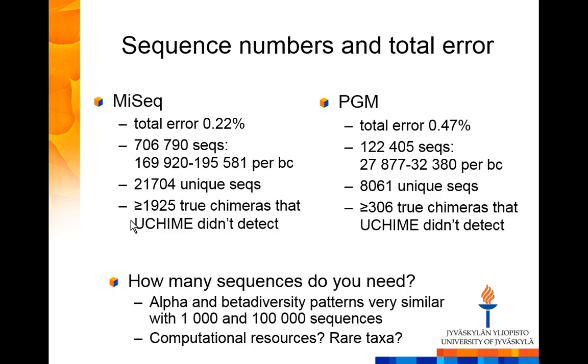Singletons should be justified as well. For example, in Vierer Lab, they do it on sequences. But we just got reviewer comments saying that you should never leave out singletons, which I don't agree with. At least for OTUs, I think it's a great idea to leave out singletons because you always have replication. If it's just a single observation, it doesn't really tell anything.